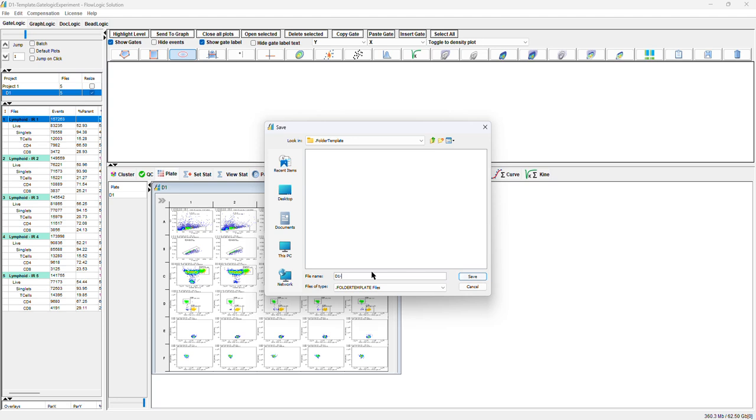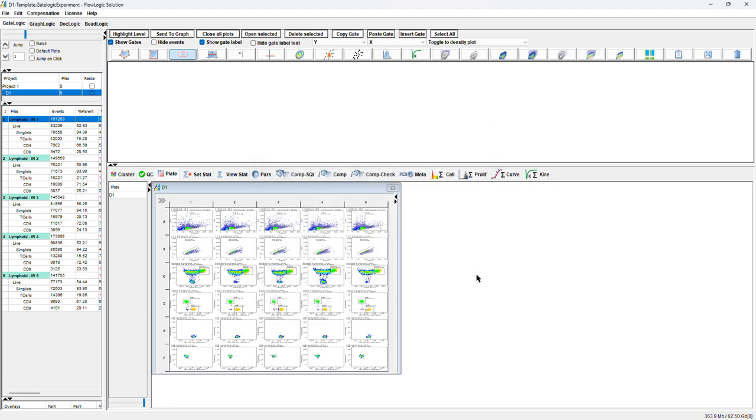And this is D1, and this CD4, CD8. Save. After I save, I can reuse this experiment as it is and apply it to the same data. In this case, what I want to do, I already have my D1. I want to apply it to ID1 and transform my ID1 into D2, day 2.